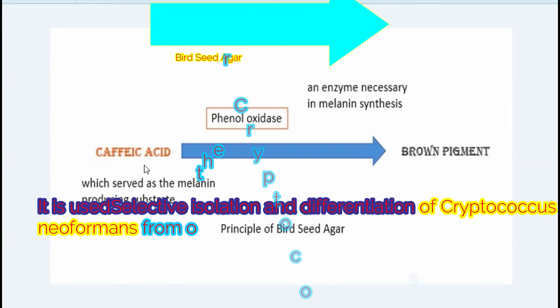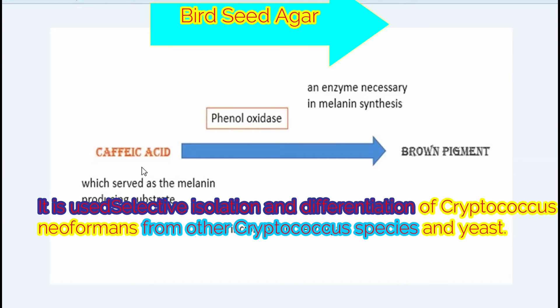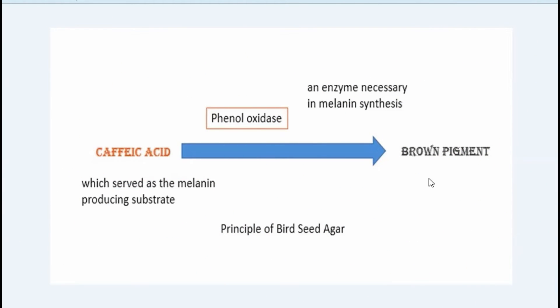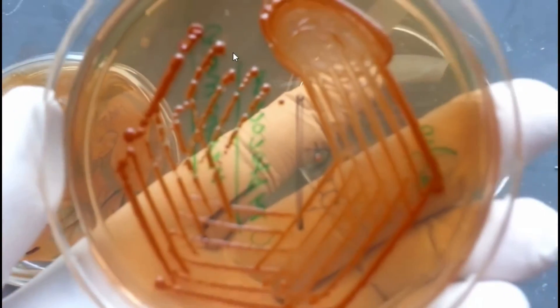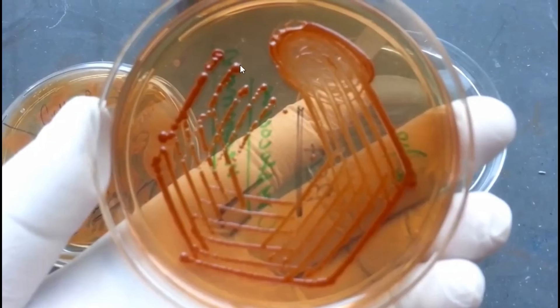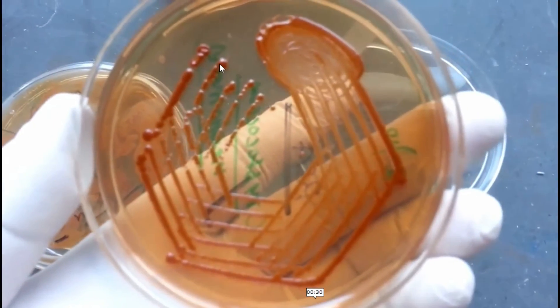The botanical name of niger seed is Guizotia abyssinica. That is why brown pigmented colonies are seen. This is also the reason it is called Cafic Acid Agar or Niger Seed Agar. Here you can see the brown pigmented colonies on Bird Seed Agar.